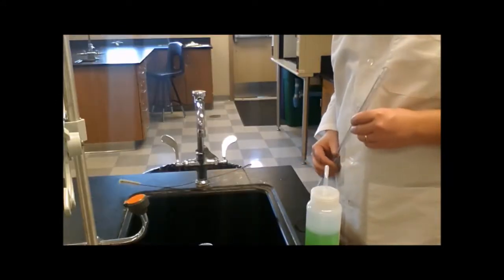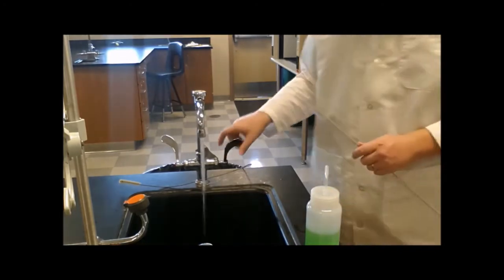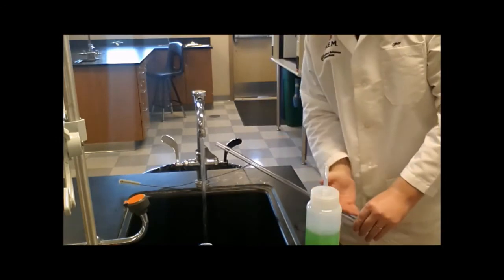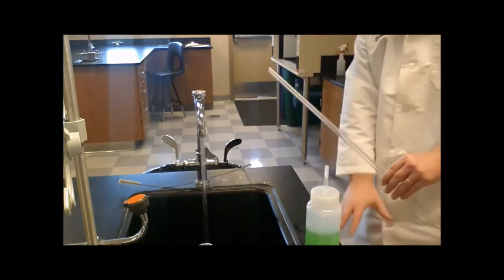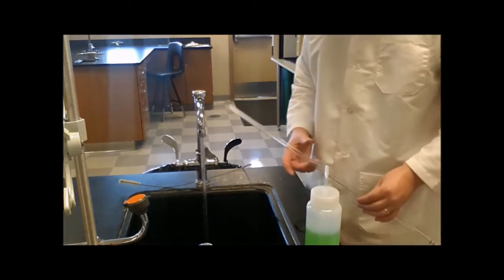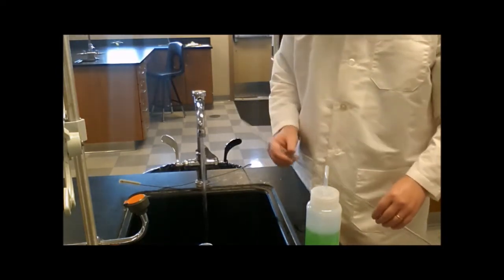So the next thing we need to do is clean the Buret. Now, if you simply take the Buret and shove it underneath the faucet, all of the water is going to roll down the Buret and onto the floor. And then you'll have a big puddle on the floor in front of the faucet, and that's not very safe. People are going to walk by, they're going to slip, they're going to fall, they're going to break their necks, and then they'll be dead.